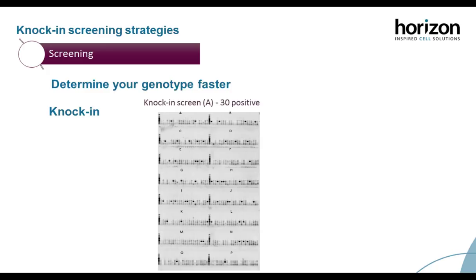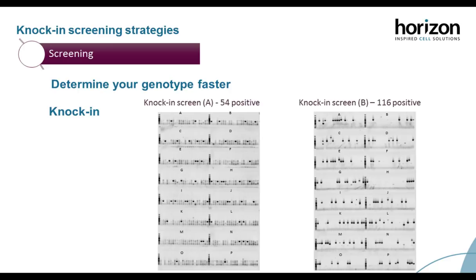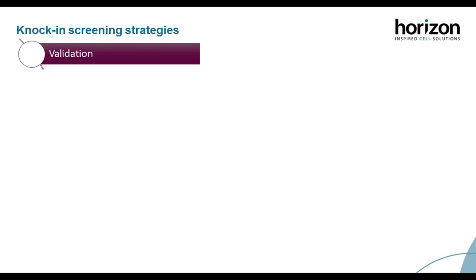So to confirm the clonality of your cell, in cell engineering we use imaging software, which can be seen on the right here. We can scan all the wells that we've done a limiting dilution in on day 0, and then look at them maybe 10 days after, or whenever the cells have grown out, to see if they're clonal or not. If you don't have this imaging software, you can also perform single-cell PCRs, or you can perform some TOPO cloning to make sure you're getting a good idea of what different alleles are present in your DNA mix in your clonal population.